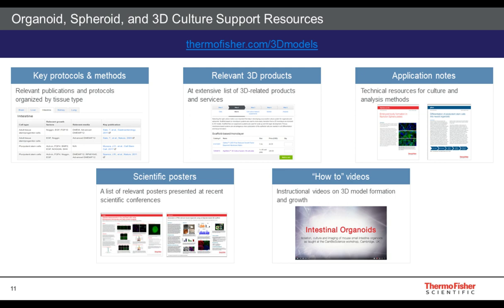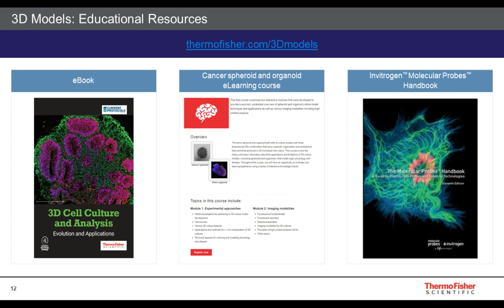And this website is by no means one and done. It's certainly something that is being continually updated. So if you are choosing to work in 3D cell models, remember to periodically check back, as there may be new information relevant to what you're interested in studying.